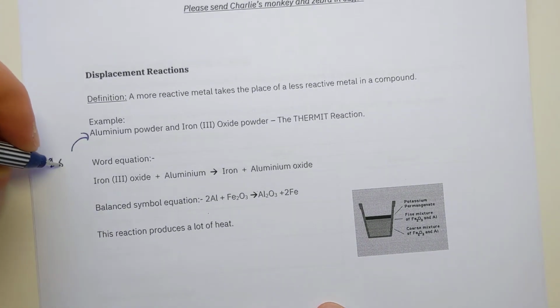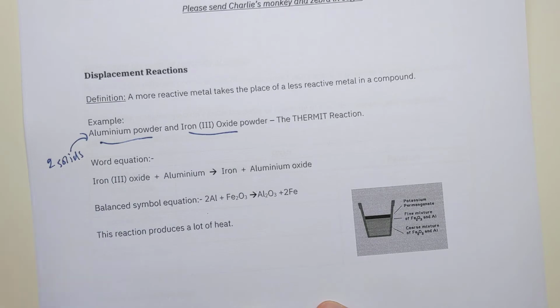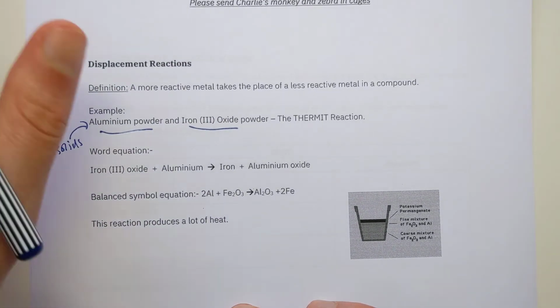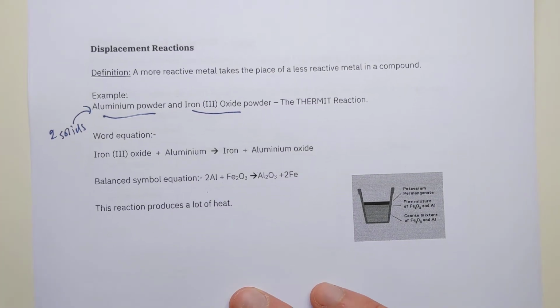So that's an example of this. The two solids here are aluminium, that's the element, and iron oxide powders, that's the compound. This reaction's got a name, it's called a thermite reaction. It's actually used to make molten iron for things like fusing railway lines together. So it's got an everyday use, but we'll not worry about that.